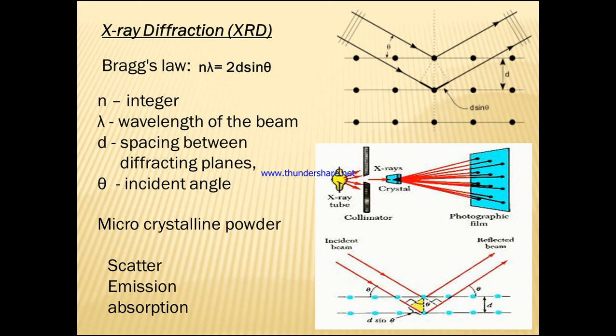These X-rays are being recorded, along with the geometry of the incident beam as well as the reflected beam, the angle of incidence as well as the angle of reflection. By using Bragg's law we can find the material which we have, based on the angle. Based on which material it is, we see the diffraction. Based on that we can analyze the material or the compound which we have here. That is what we have with respect to X-ray diffractometry here.